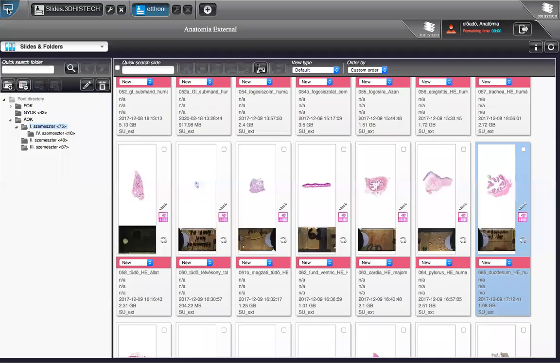So eventually, obviously, I cannot review all slides, but I tried to cover the most important aspects from the basic tissues, and some of the important and frequently asked stuff related to the GI tract. But this is the exact way of the examination. So the examiner will ask you beside the screen and ask you from the theoretical background, and it's also essential to recognize the structures. Do you have any question?